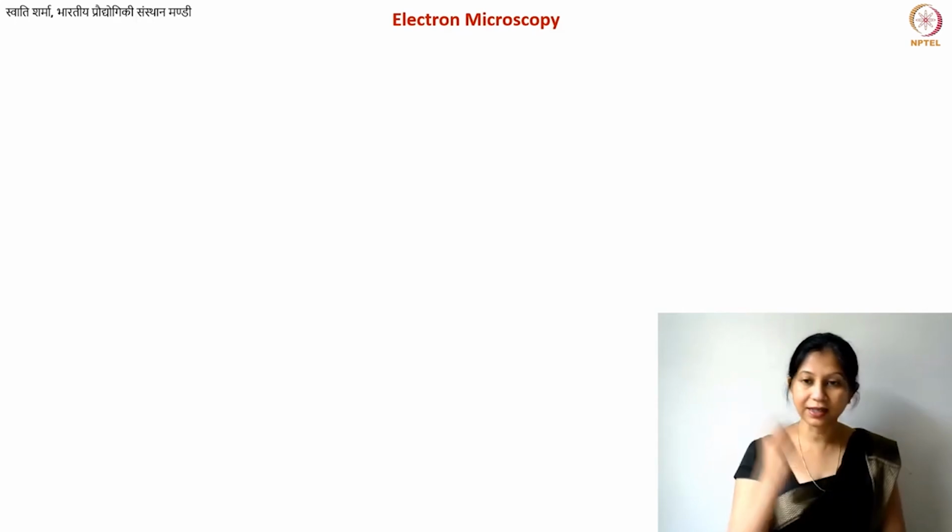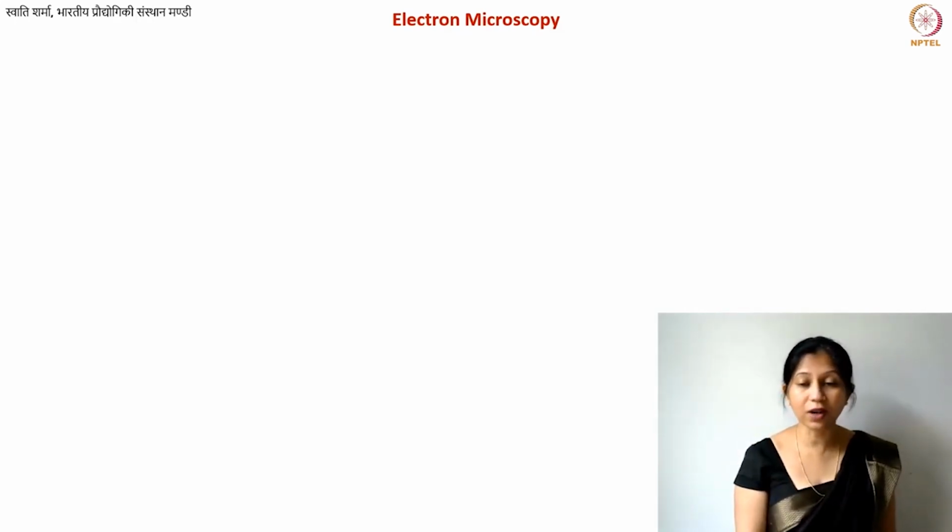In this lecture, we are going to discuss another characterization technique for carbon materials, electron microscopy. Our focus is going to be on transmission electron microscopy, because this is the microscopic technique used for looking at the microstructure. I have already shown you a couple of transmission electron micrographs before, also to help you visualize how your carbon material looks at a very, very small scale, at an atomic scale.